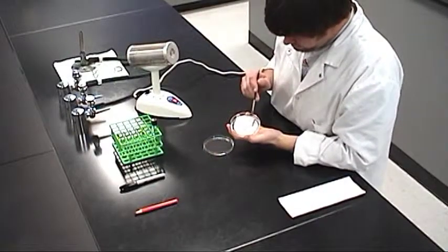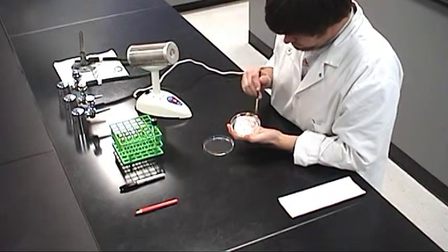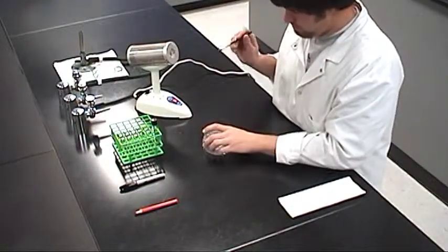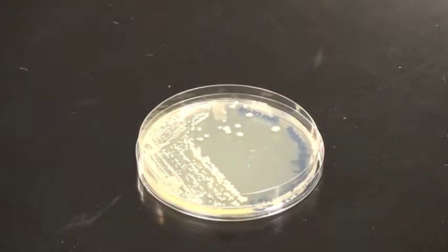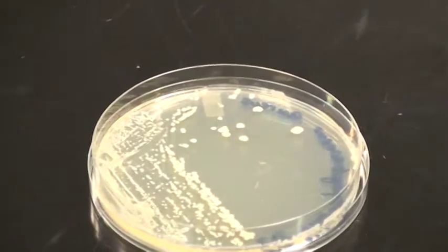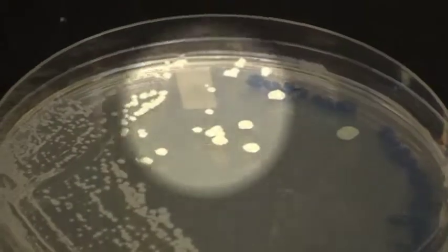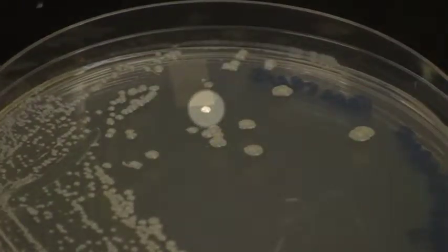This video demonstrates the correct way to prepare a streak plate. A well-prepared streak plate produces an area that contains a single colony of an isolated bacterium species from a single organism to be used for experimentation.